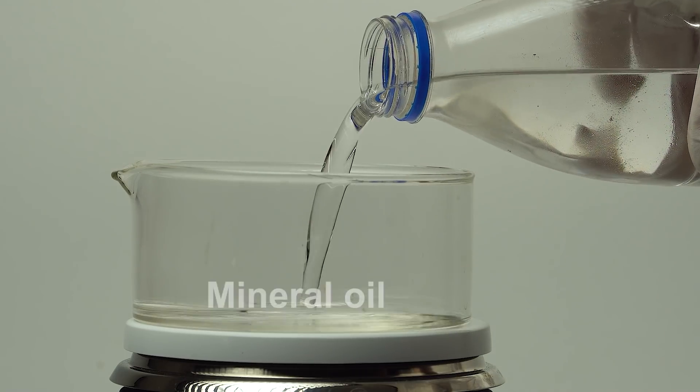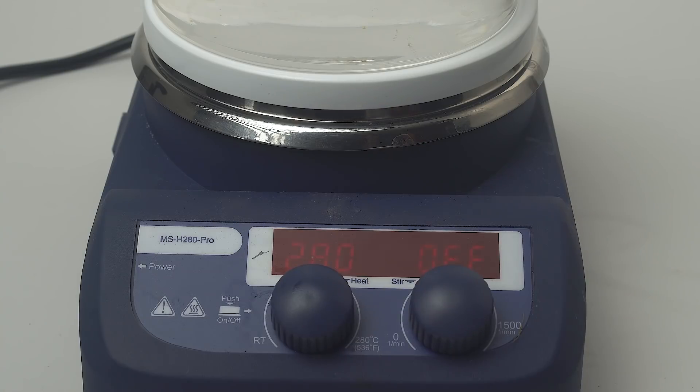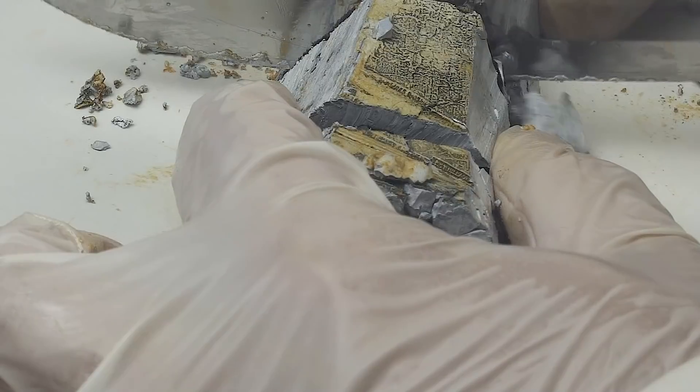We'll need one plain piece of potassium, and to get it let's just melt it out of the potassium that I have. Potassium melts very easily — for this I put pieces of potassium in hot mineral oil.